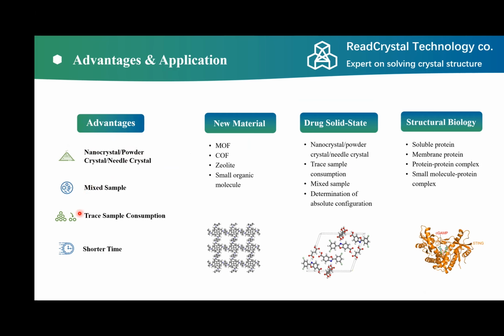And because we skipped the crystal growth step, we saved a lot of sample, so it decreased the total sample consumption, and we can also significantly reduce the time for determining the structure, because we skipped the step which costs the most time.